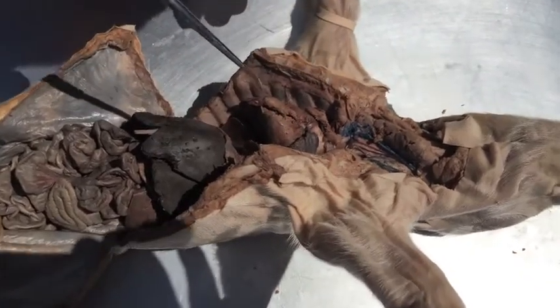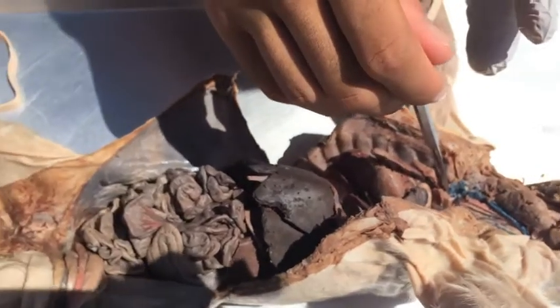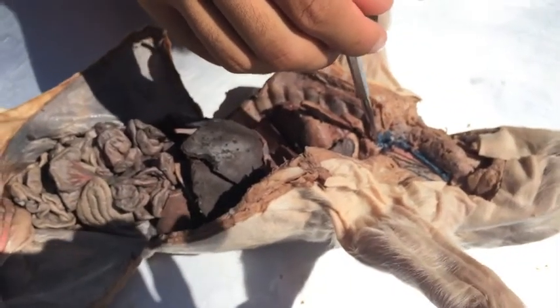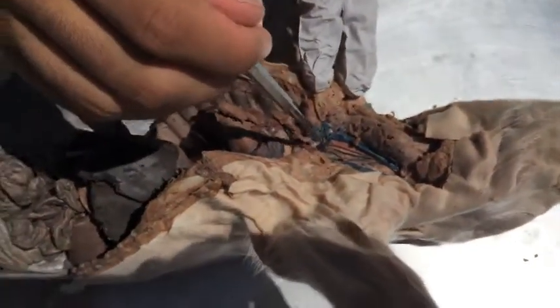The common carotid artery is down here, and it supplies the head and neck with oxygenated blood. The brachiocephalic artery, I might have butchered that a little bit, is going to be right here. It's on the right side, right here, and it supplies blood to the tissues of the brain and the head.